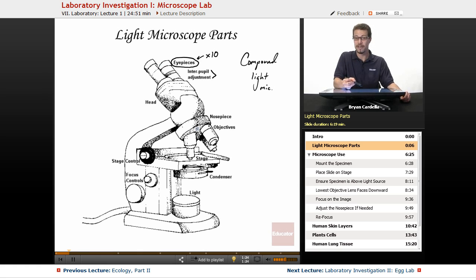But it's not just the eyepieces that the image is traveling through. It's actually going through these objective lenses. The head of the microscope here, the nose piece, is an important part in terms of rotating these objective lenses. The way that you would tend to hold the microscope if you were picking it up is by the neck and the base. I typically instruct students to grab the neck with one hand and put their hand under the base just to make sure you're not going to drop it.